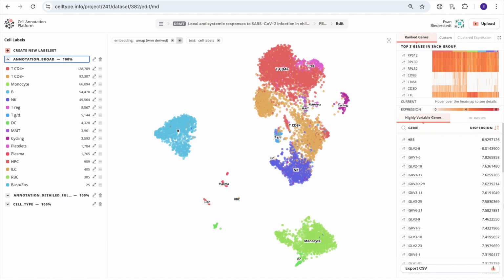We've tried to create this easy-to-use web browser such that scientists can work directly via the molecular data and create cell annotations. And they would do this for two reasons primarily. One is to share with their collaborators for review before publication with the public. And the second is to share these cell annotations with the scientific community for reviews.